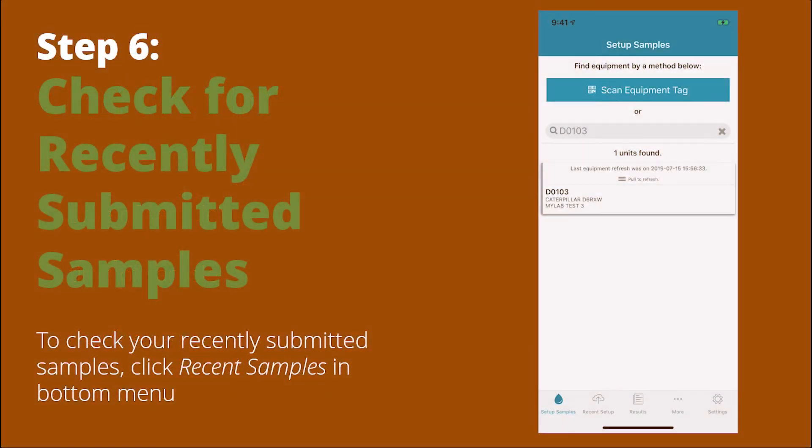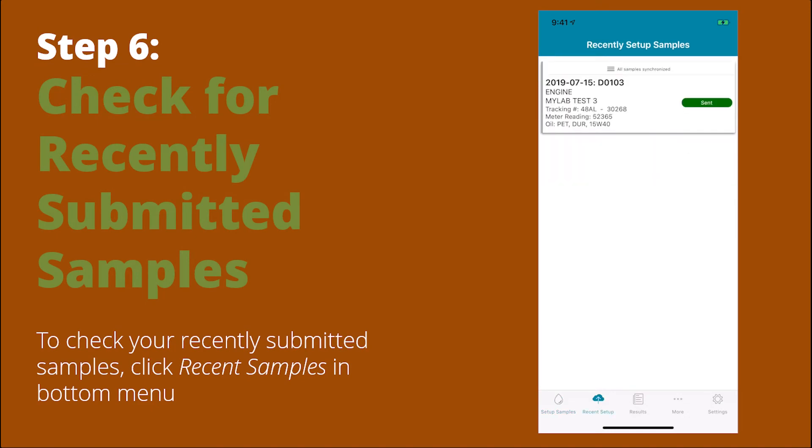Step six is optional. You can check for recently submitted samples by going to Recent Samples in the bottom menu.